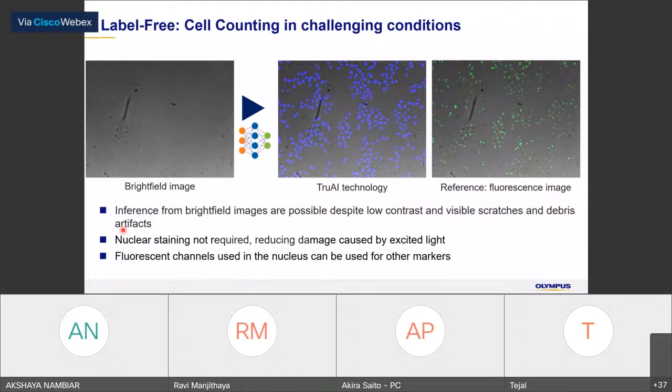And then after that, even if there is no fluorescence information, we can identify the nucleus, for example. And of course, it will match with the fluorescence image.